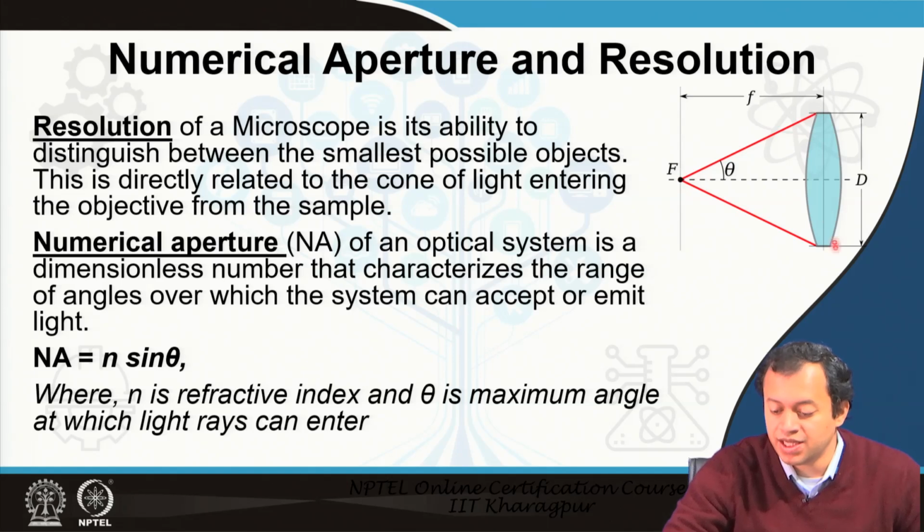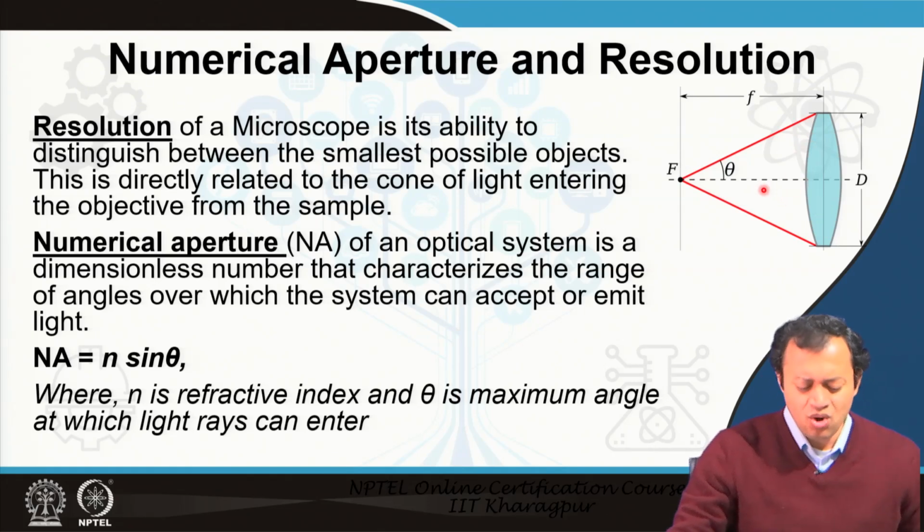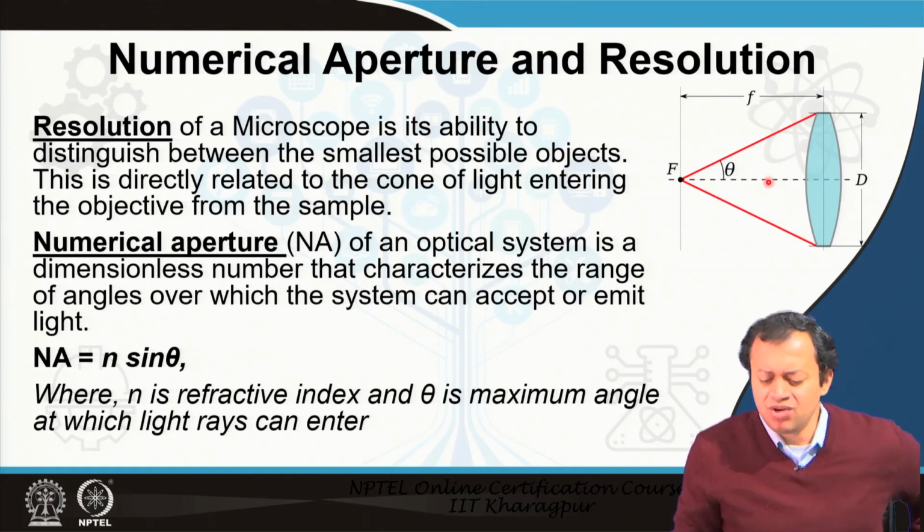It can only take light at a specific focal length. Any light going in this particular direction will not be taken.